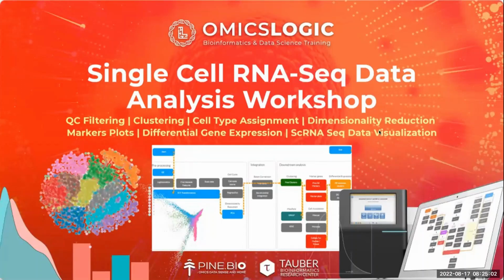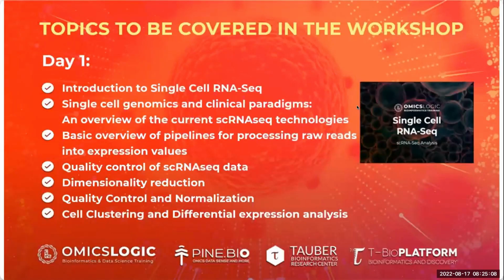Let's move on to the next session for today's workshop. This session is going to be an overview of single-cell RNA sequencing technology. We are going to get introduced to cell barcoding, UMIs, and a typical overview of experimental design.